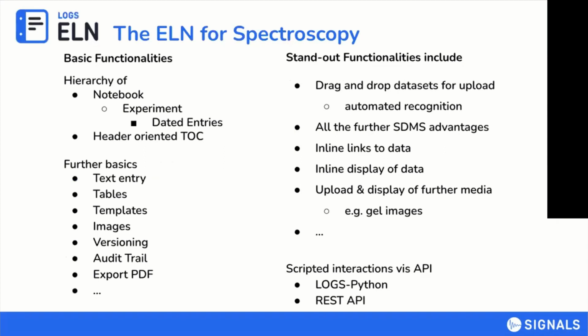Okay, more specifically to our ELN now, and then after me there's Sina with the API. He's got some nice examples to show. So our ELN is very young. As a matter of fact, it's so young that it's not even on our website yet. Maybe you'll have noticed that, but that will change soon.